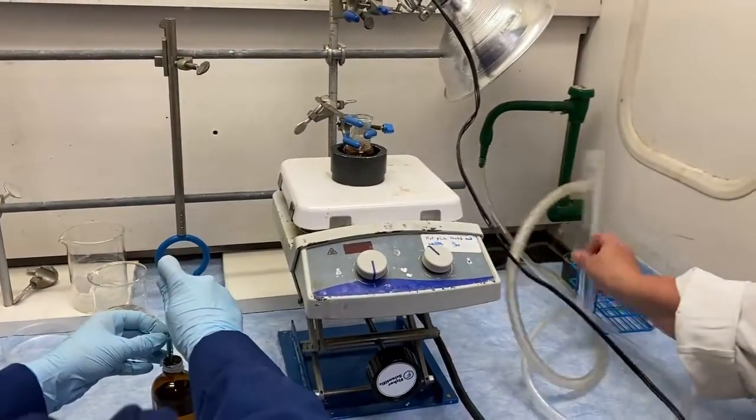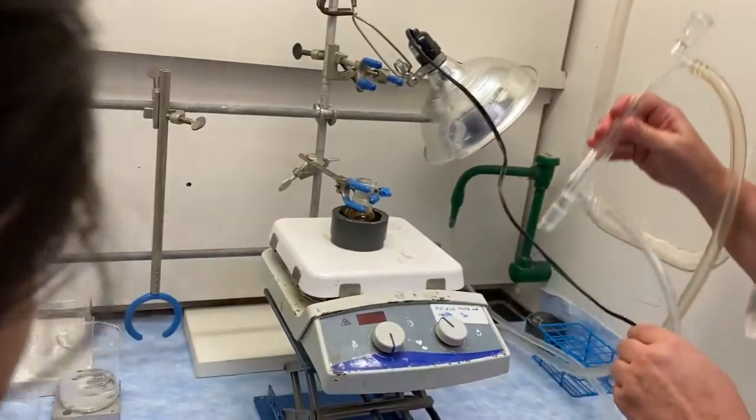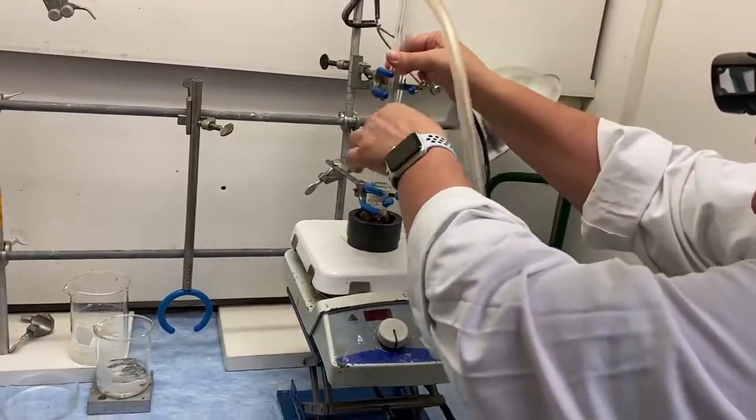I'm gonna go ahead and hook up the condenser. Okay, after Karen's done. Okay, remember it's always water against gravity.